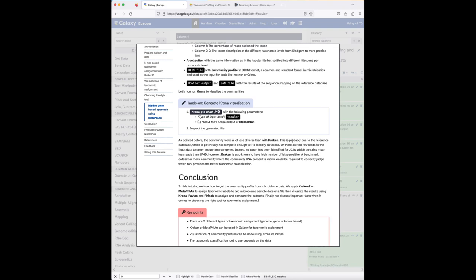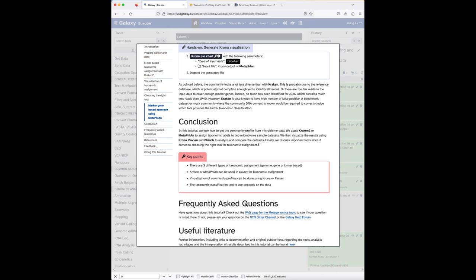The community looks far less diverse with MetaPhlAn compared to Kraken, possibly due to an incomplete reference database or insufficient read coverage of marker genes. This dataset probably needs to be changed in future tutorial versions to better showcase MetaPhlAn's capabilities. In summary, this tutorial covered how to perform taxonomic profiling of metagenomic data using Kraken and MetaPhlAn and how to visualize results with Krona and Pavian.